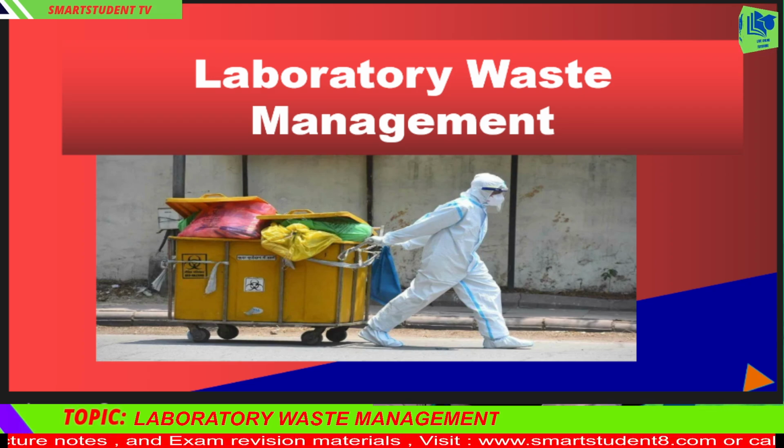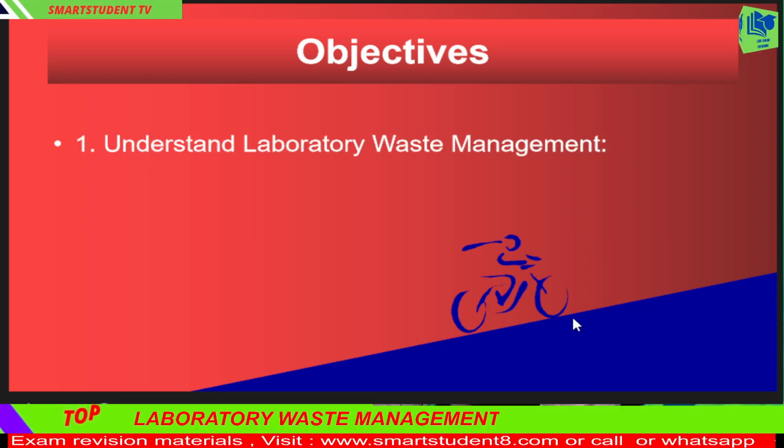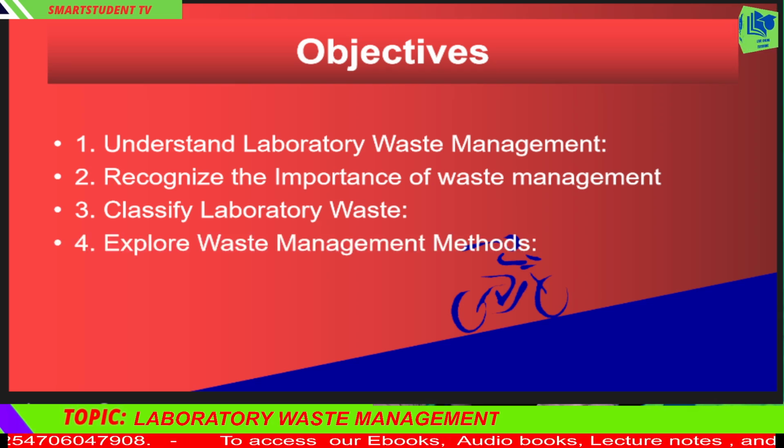Objectives of this tutorial. By the end of this tutorial, you will be able to: 1. Understand laboratory waste management. Gain a comprehensive understanding of what laboratory waste management entails. 2. Recognize the importance. Identify why proper laboratory waste management is crucial for safety and sustainability. 3. Classify laboratory waste. Learn the different types of laboratory waste and their sources. 4. Explore waste management methods. Understand the various methods for managing and disposing of lab waste.